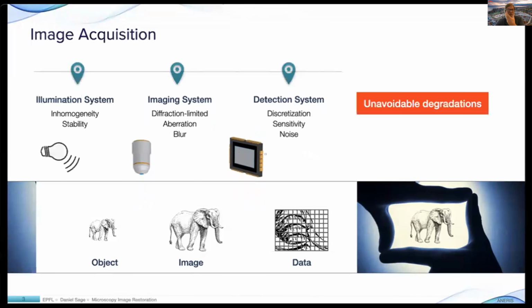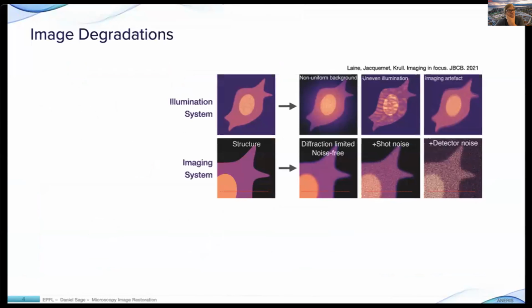So there are all these systems. I should mention, and it is very important also in marine biology, the illumination systems. Usually you illuminate the object. We use more light in light microscopy, obviously. But all these systems affect the quality of the image, and there is obviously unavoidable degradation, and I want to show the kinds of degradation that we have in microscopy.